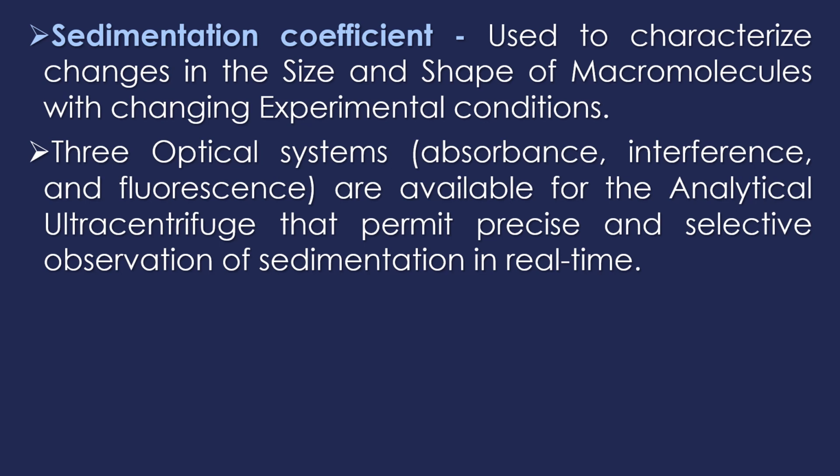The sedimentation coefficient can be used to characterize changes in the size and shape of macromolecules with changing experimental conditions. Three optical systems, including absorbance, interference, and fluorescence, are available for the analytical ultracentrifuge that permit precise and selective observations of sedimentation in real time.